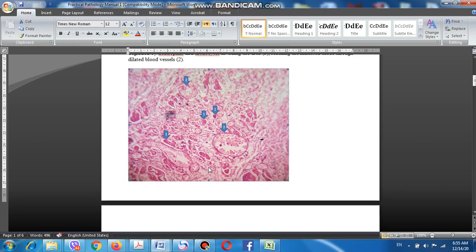Later on, these infarcted myocardial cells will be removed by the inflammatory infiltrate, by inflammatory cells — neutrophils, followed by macrophages.